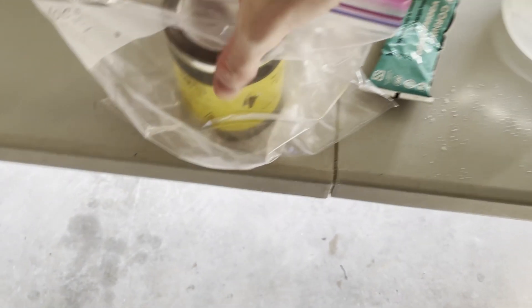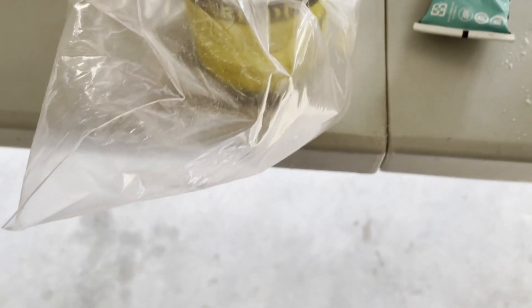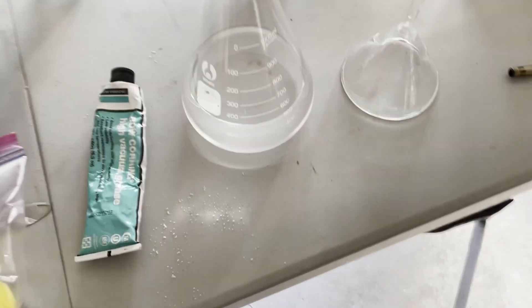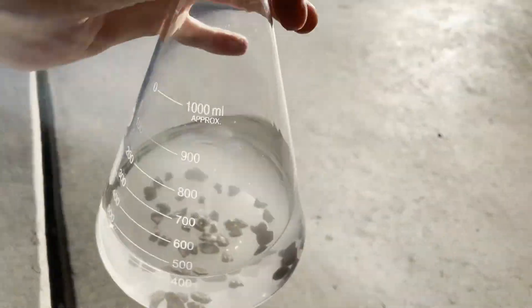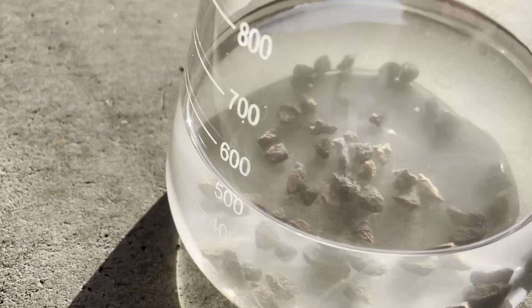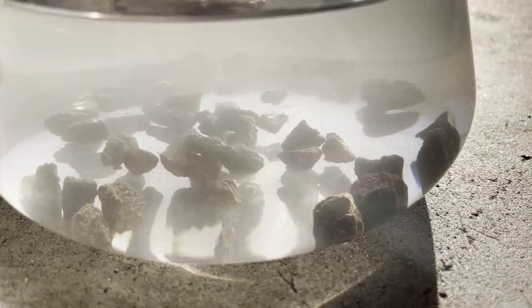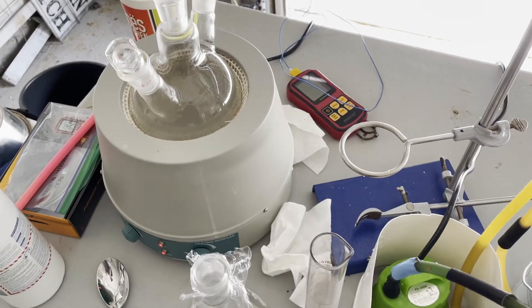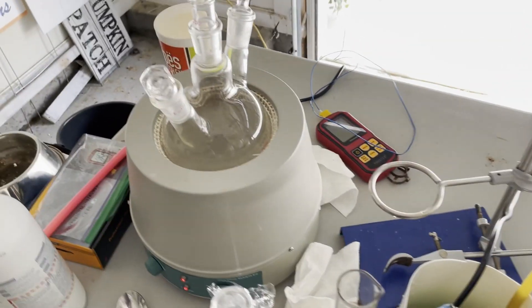Speaking of the carbide step, it was now time to do that, so all I did was add a decent amount of calcium carbide to the ethanol. I then let the calcium carbide sit in there for around two days. You can see in the video small bubbles coming off, which is the water present in the ethanol getting destroyed. After the allotted time, it was time to distill the ethanol.